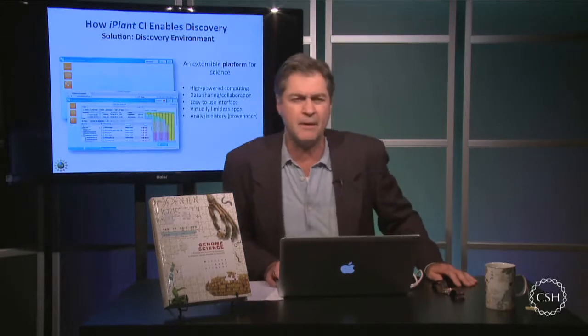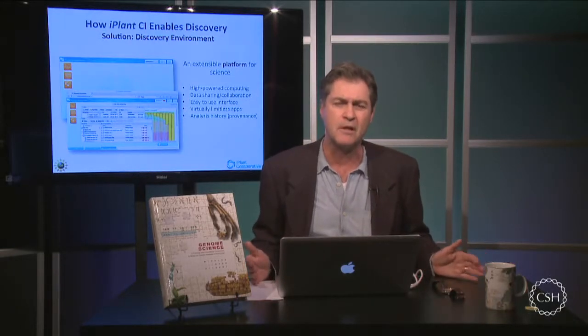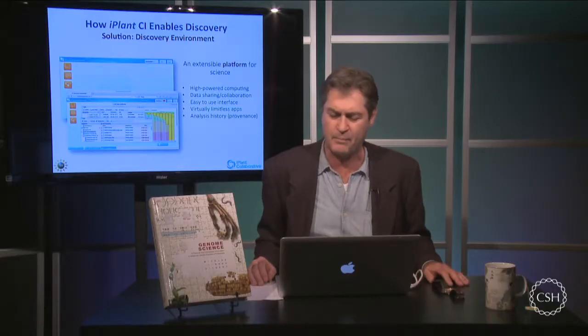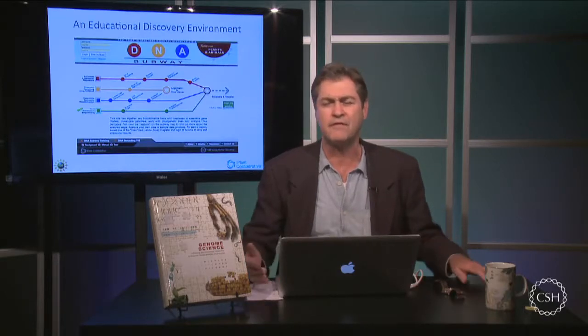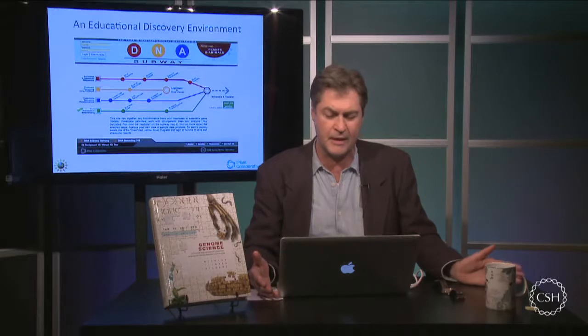Well, the key element of the IPlant cyber infrastructure is what we call the discovery environment. It's essentially an app store for lots and lots of applications that could help you solve many problems in biology. I encourage you to look at it and to explore it for the tools that may help you. But today, we're going to use the sort of educational analog to the discovery environment, which we call DNA Subway.